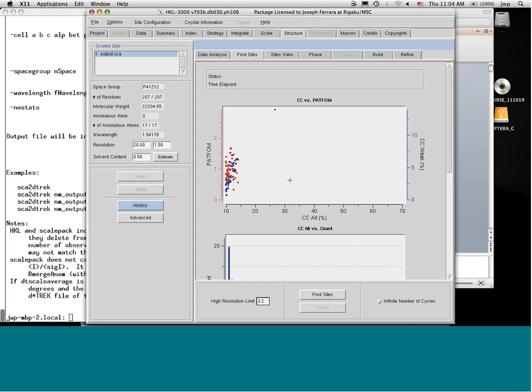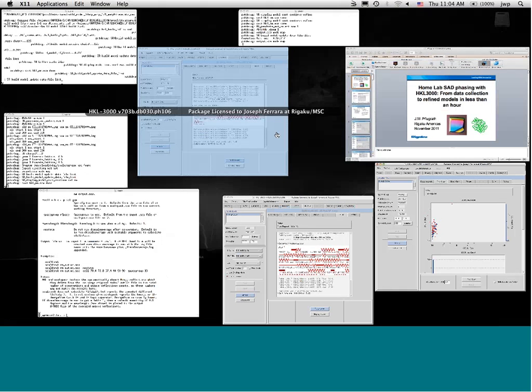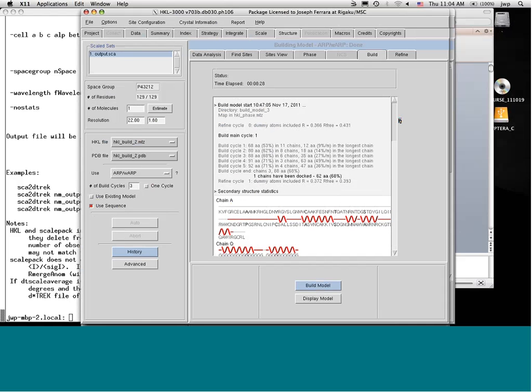Do you have a recommendation for data resolution for trying sulfur SAD? I would try it with anything. The main thing here is that it's so easy to put in a halide. I don't see why you don't try that as well. Tom Edwards from Emerald Biosystems gave a nice webinar on that, and you should watch that and decide what to do with that. It's really pretty good. He had good success with that, and that one is recorded and it's on the website. So I agree, you should try that as well.